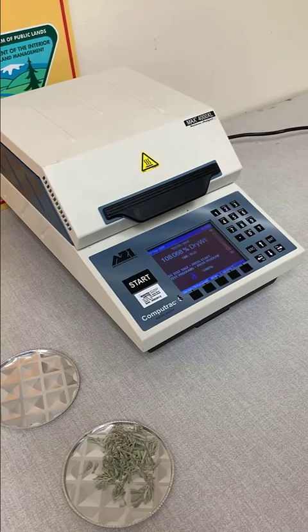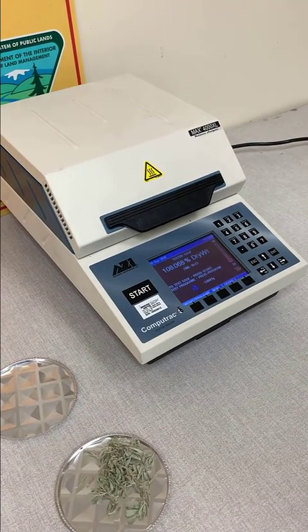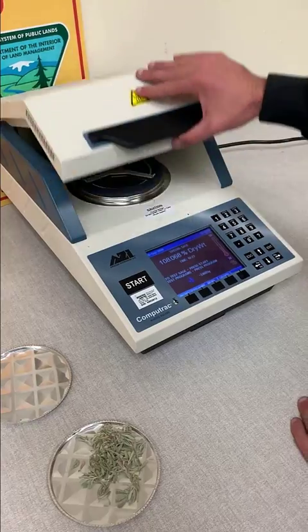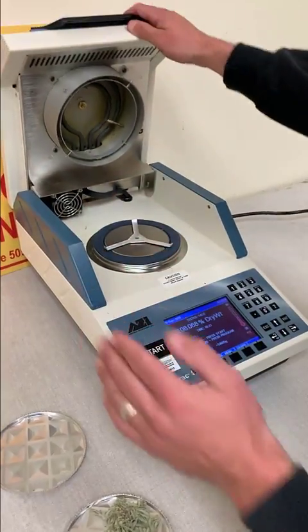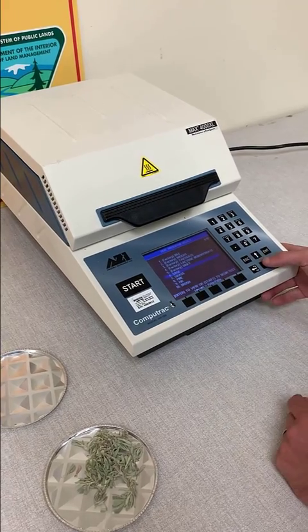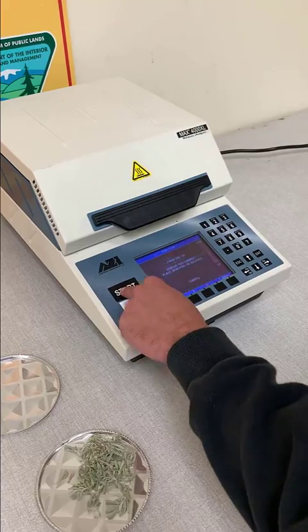Back here with the CompuTrack 4000XL, which we will be using to get our fuel moisture. It's a very easy piece of equipment to use with a nice interface, built-in scale, heating element, and fan. In order to get to our program that we would like to test — you can see we are already set up — but we can go to Program, select Sage, and then all we have to do is click our start button.